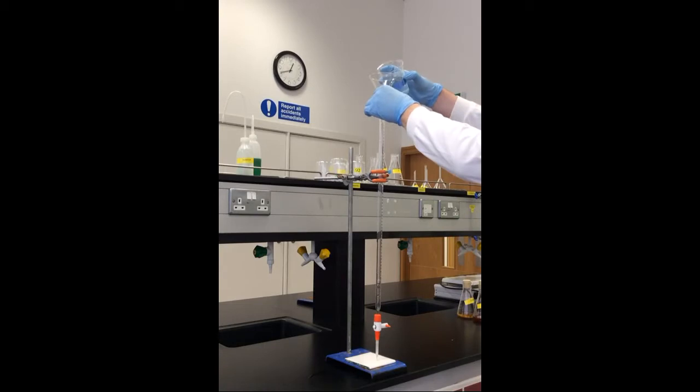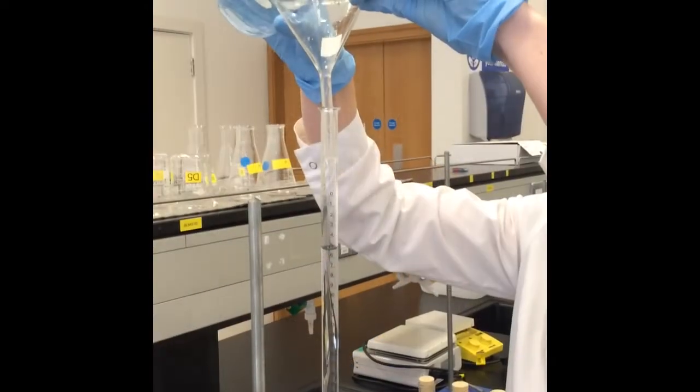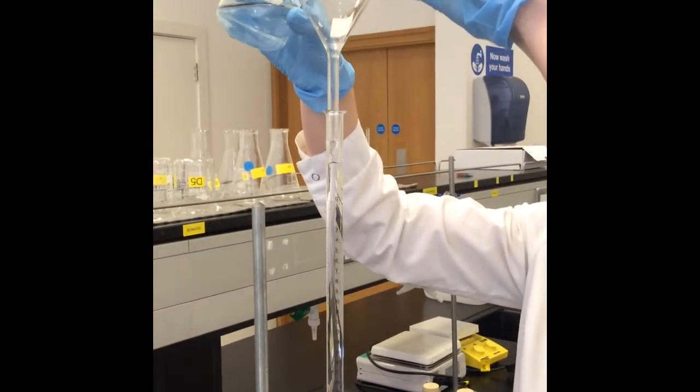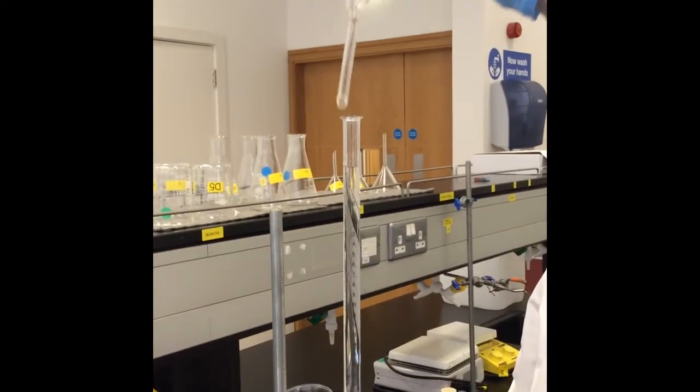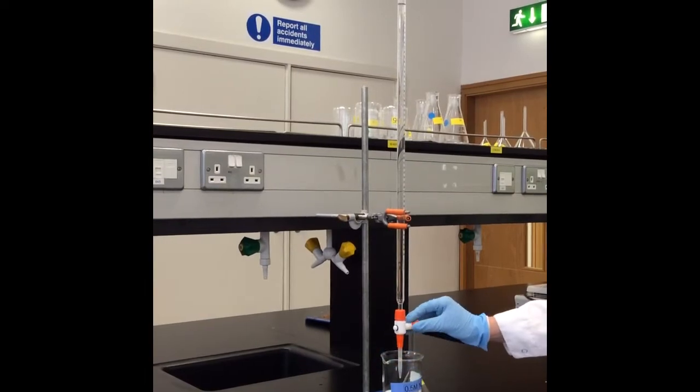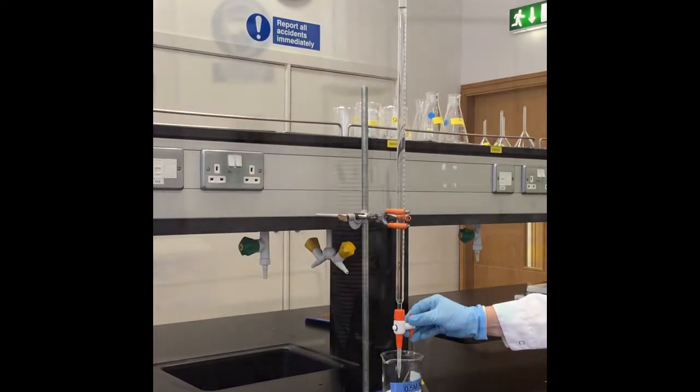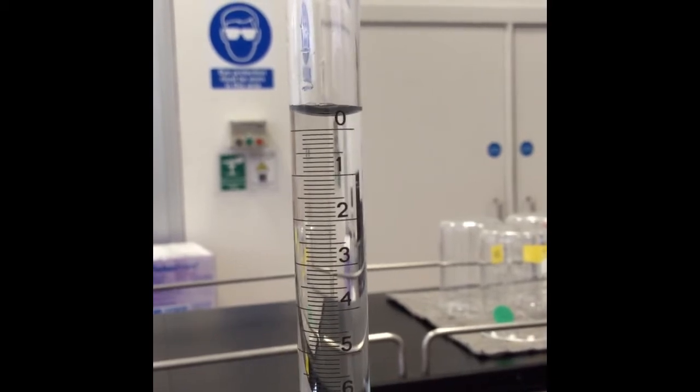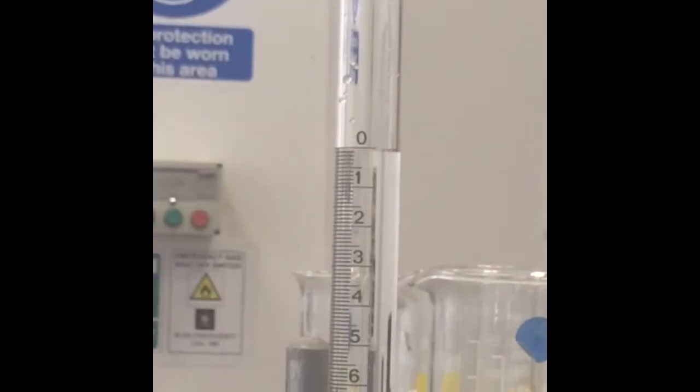0.5 molar sodium hydroxide was carefully added to the burette using a funnel. To obtain an accurate reading, the sodium hydroxide was added above the zero line on the burette. The sodium hydroxide was then carefully lowered until the zero line was reached on the bottom of the meniscus. This ensures an accurate reading for all the titrations.